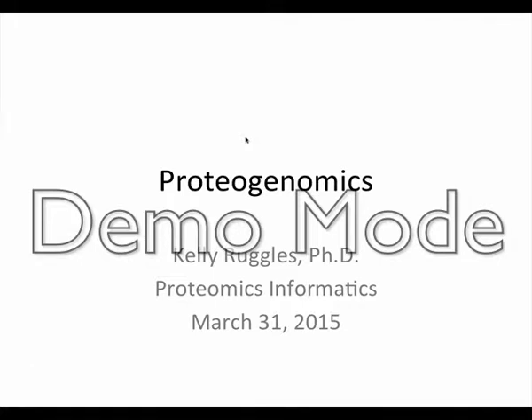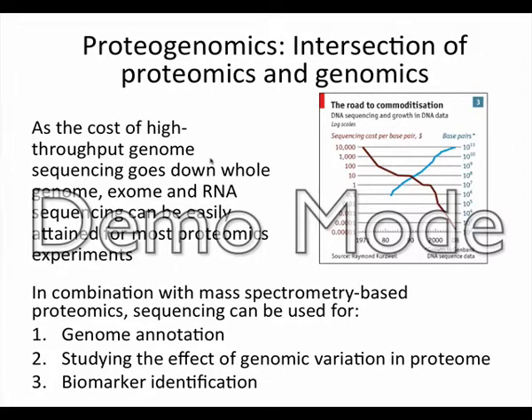Okay, so I'm just going to talk to you a bit about proteogenomics. I don't know if this is working. Okay, so just some basics on proteogenomics. It's the intersection of proteomics and genomics, as the name alludes to.